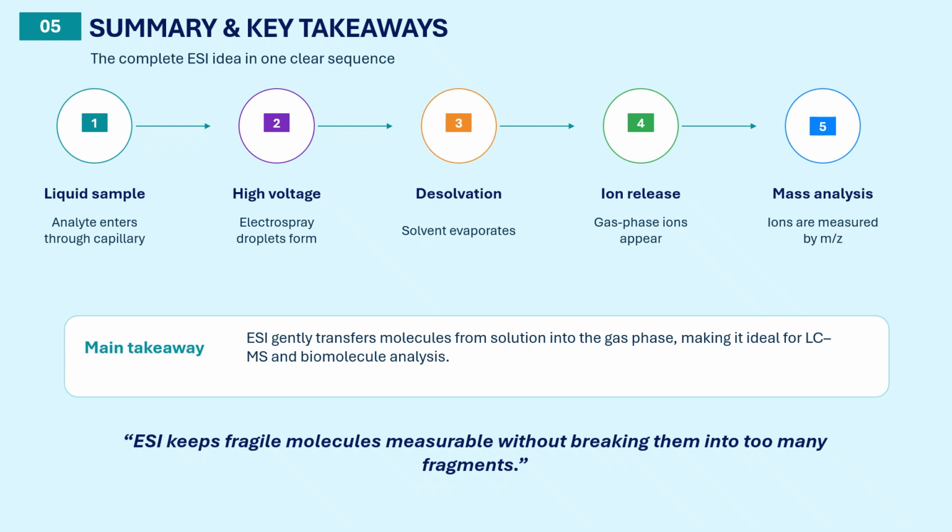Step 5. Mass analysis. The released ions enter the mass analyzer, where they are measured according to their mass-to-charge ratio, m/z. Main takeaway: ESI gently transfers molecules from solution into the gas phase. This makes it ideal for LC-MS analysis and for studying biomolecules like proteins, peptides, and metabolites.